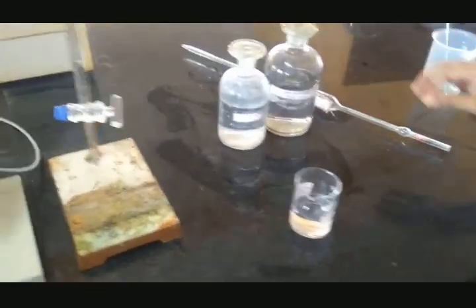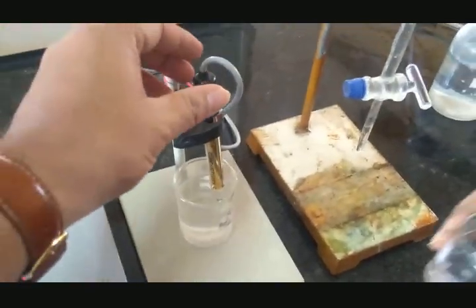So once you transfer, this is the conductivity cell.